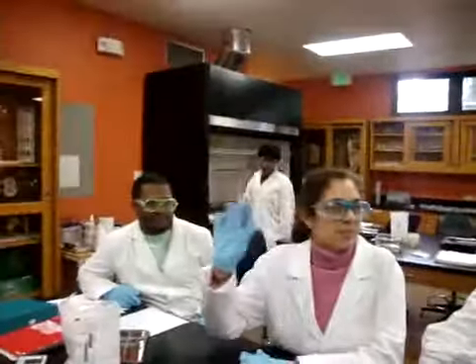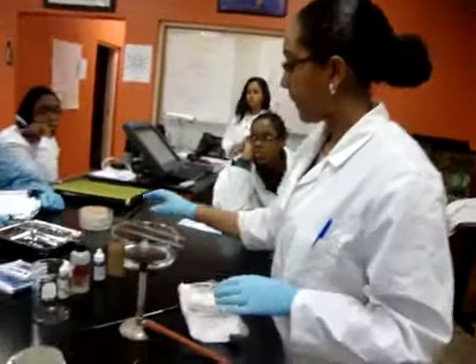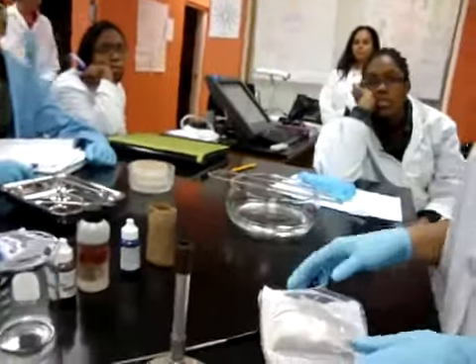If you leave the lab at any time during the experiment, wash your hands before you leave the lab to do whatever you're going to do, and put your gloves back on when you come back in. And of course, when you're finished the whole lab, wash your hands before you leave.